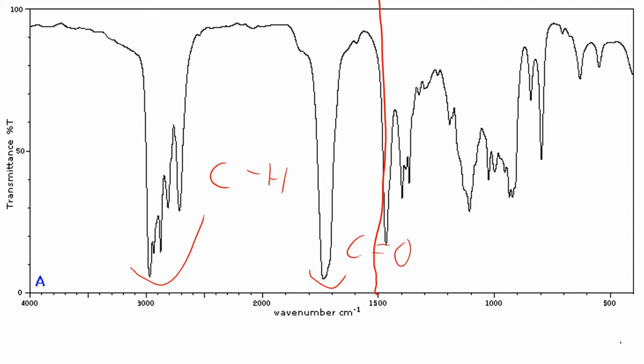So if there was an alkene bond, a C double bond to H, so an H bonded to a C, which is double bonded to something else, probably another C, if there was one of these bonds present, we would expect to see a peak right around here, just a little bit above 3,000, 3020 to 3,100 it says on your resource sheet. We do not see a peak there, so we know that there is definitely not this bond present. Absence of a peak for infrared spectroscopy does give you information.